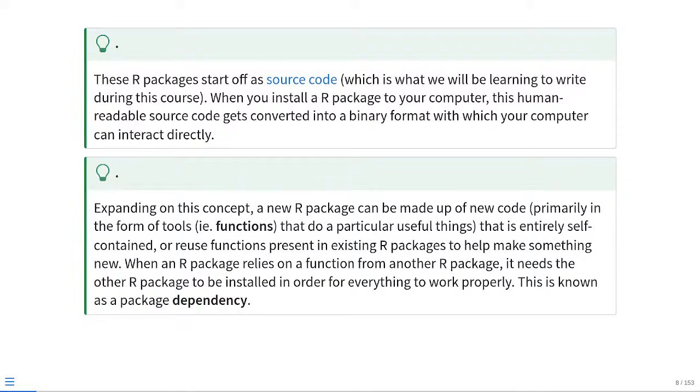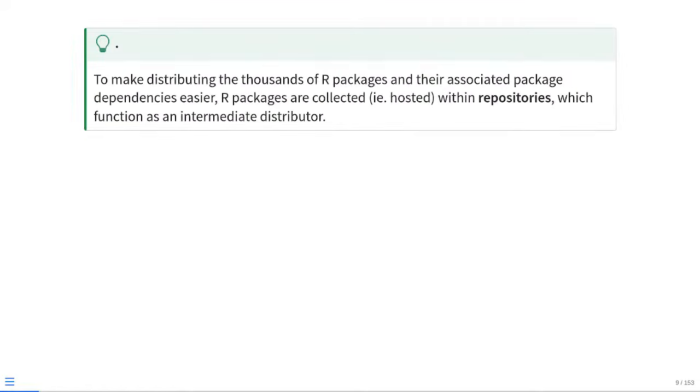But at the same time, you introduce a dependency on having their R package installed. So when we're talking about dependencies later today, this is the concept of the R package you're trying to install borrowing something from another package. Therefore, that other package needs to also be installed before the package you're interested in can successfully build on your computer and be used.